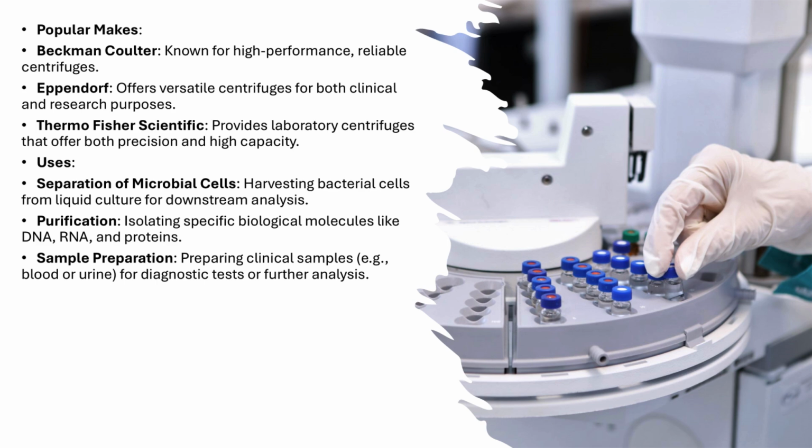For example, they're used to separate blood components, like plasma or serum, for diagnostic tests, or to prepare urine samples for further analysis. In summary, the centrifuge is an essential tool in both microbiology research and clinical diagnostics.